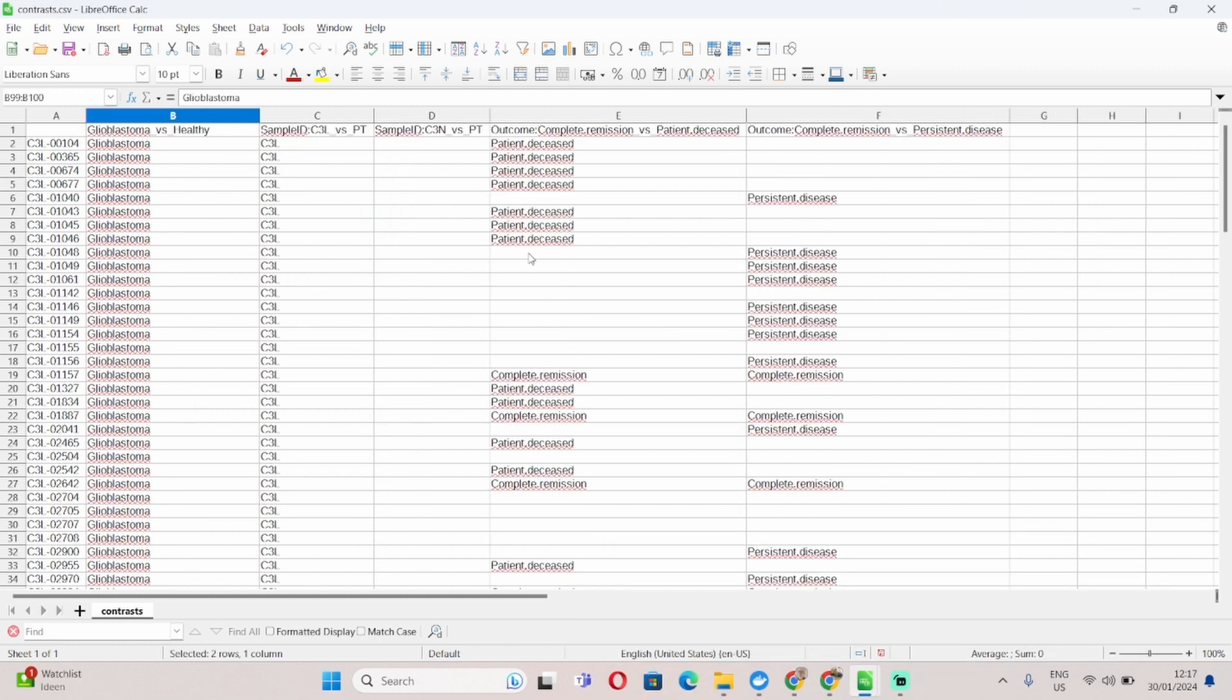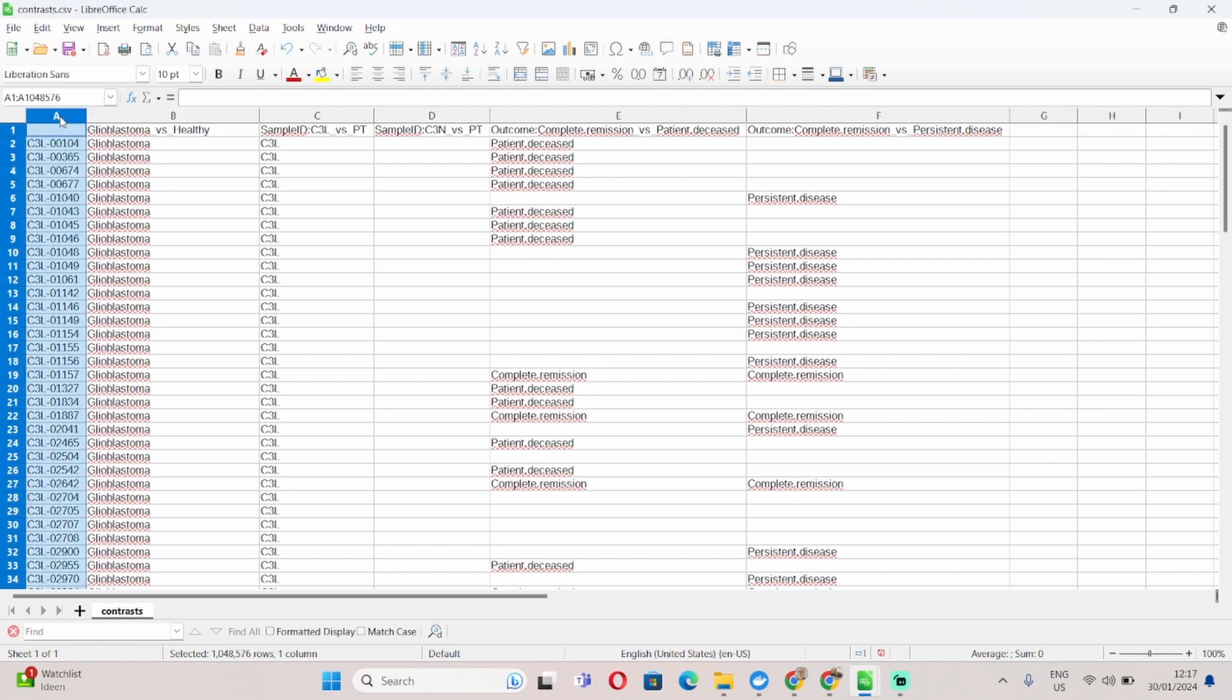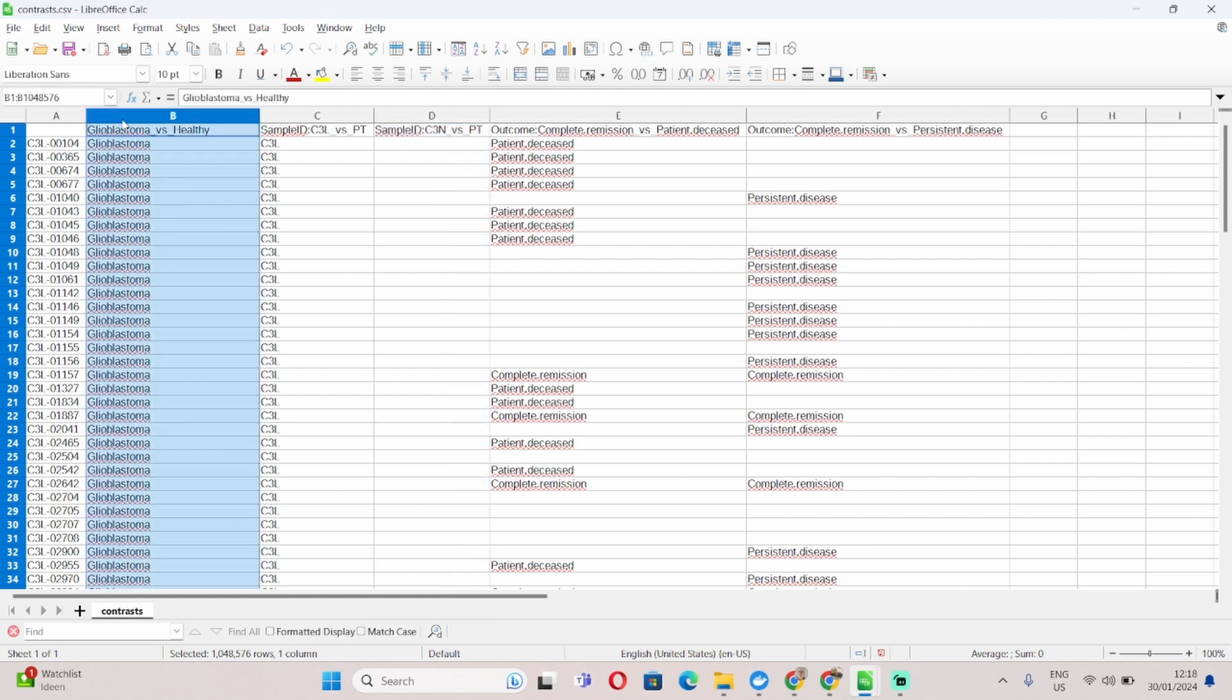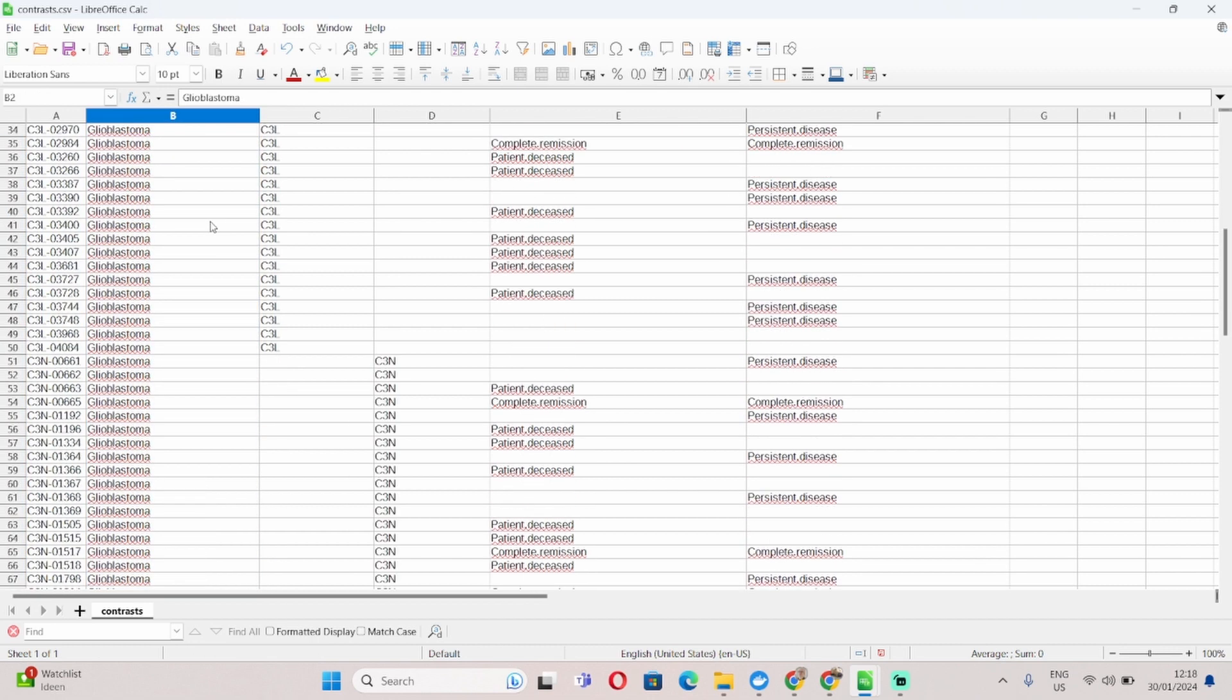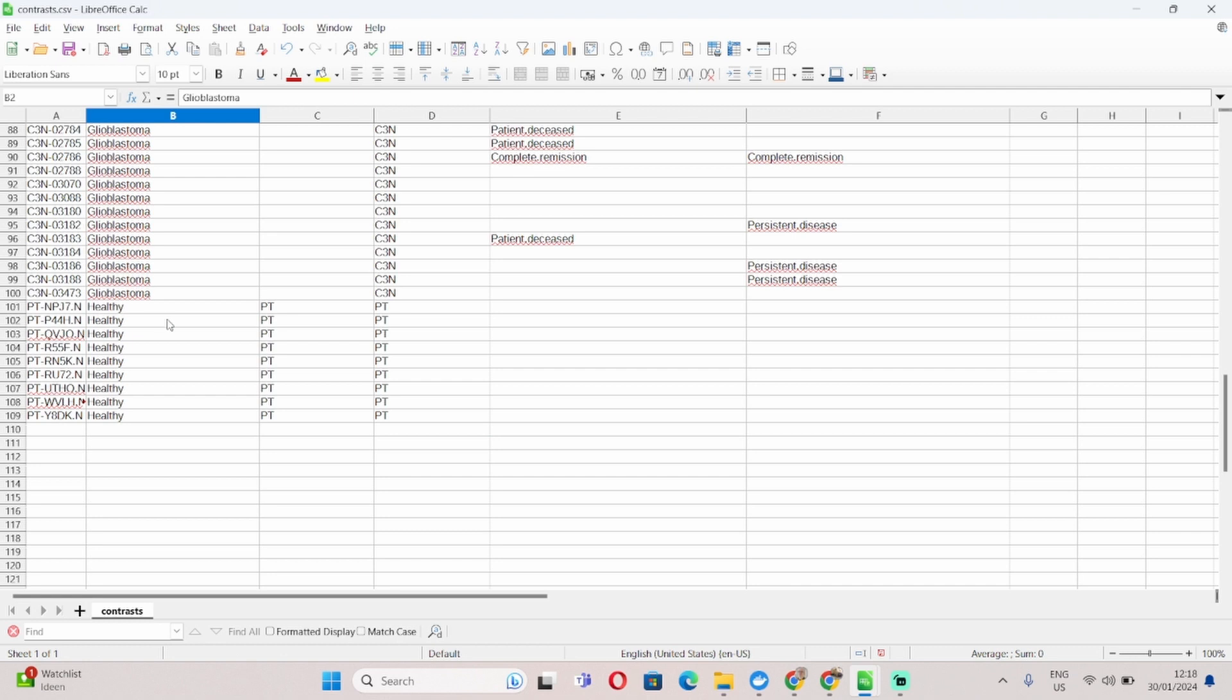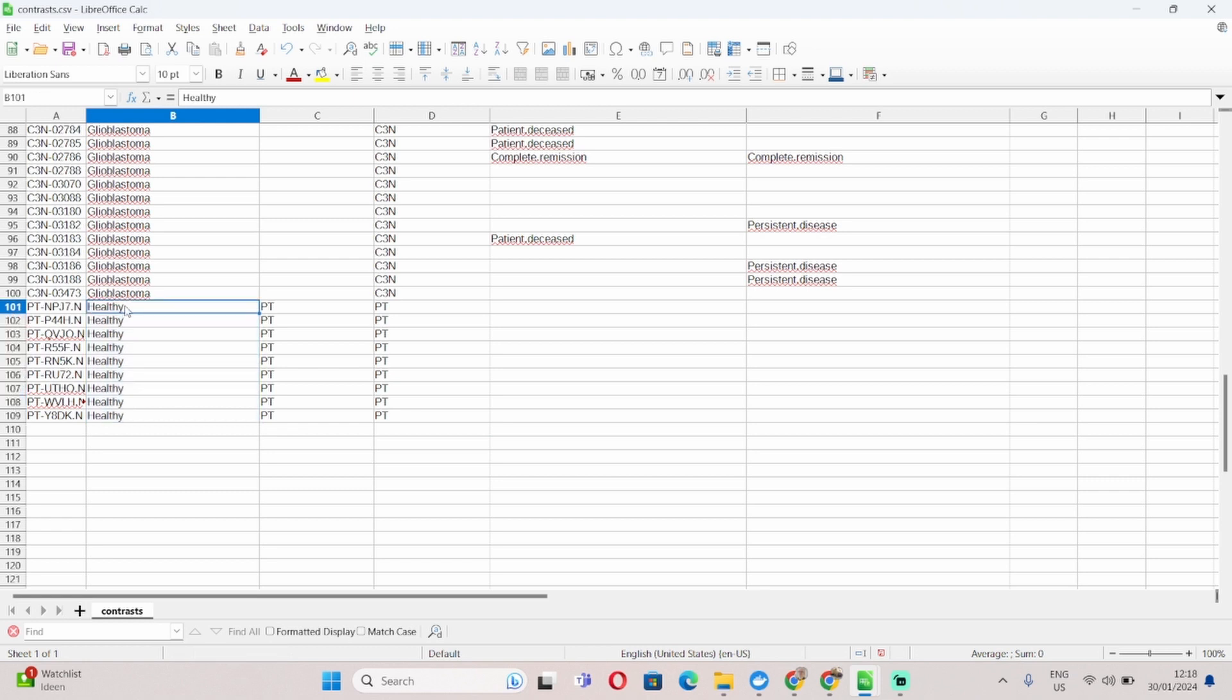The final input file is the contrast.csv file. Again, it follows a format similar to the samples file. You will have in the first column your sample IDs, and then in each one of the following columns, you will have your different pairwise comparisons. So you can see here for example my first pairwise comparison is glioblastoma versus healthy, and I labeled all the samples that are glioblastoma with the name glioblastoma, and all the samples that are control as healthy.